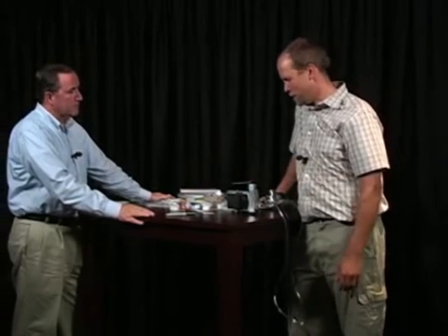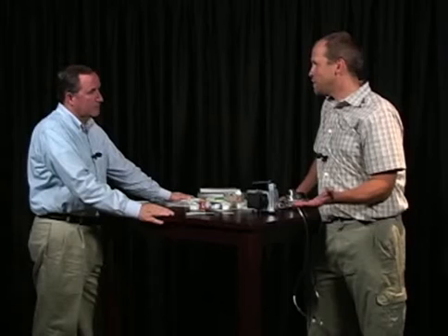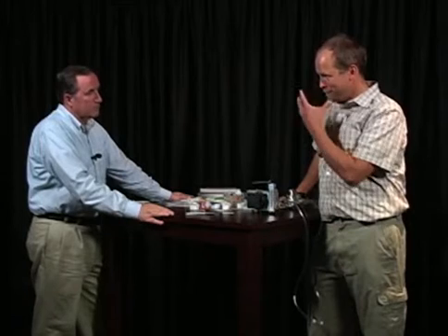We were talking about wearing gloves or not wearing gloves, or being careful what you touch with the air sampling devices. Should you wear latex gloves on every mold sample, no matter what you're doing? Especially if it's a surface sampling, respirator, full face. Well, those are good questions. There's no one single answer.